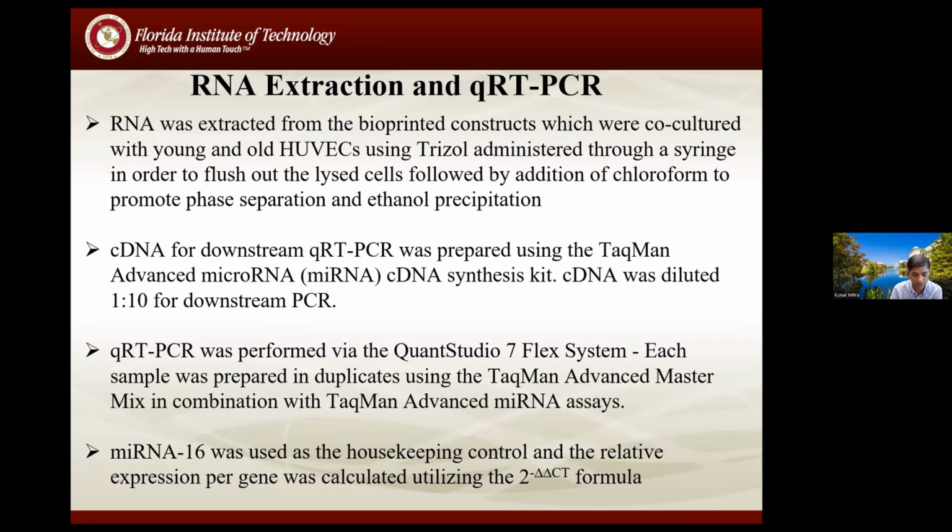Because for cardiovascular disease, we are going to show that there are certain types of microRNA which are either overexpressed or underexpressed. So we were able to extract the RNA, and initially, just before doing the microgravity experiment, we want to make sure that the tissue, because there are always skeptics, can the 3D bioprinted tissue replicate the real science?